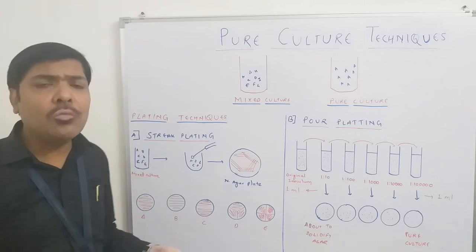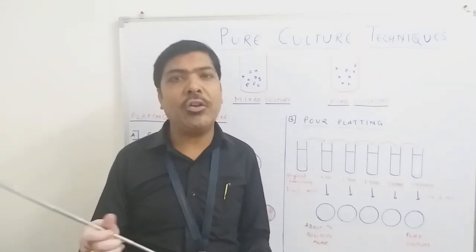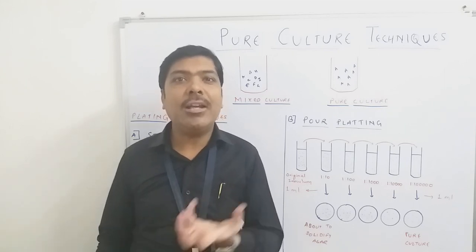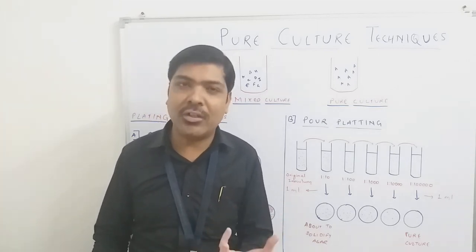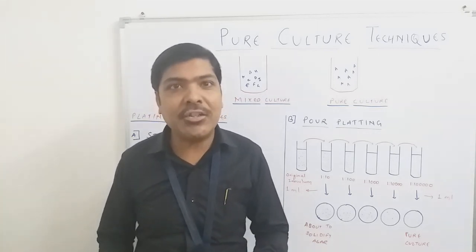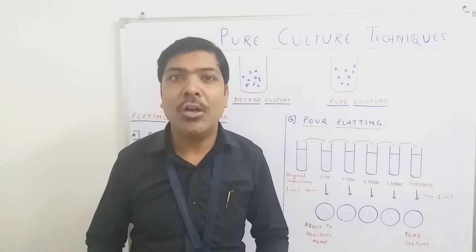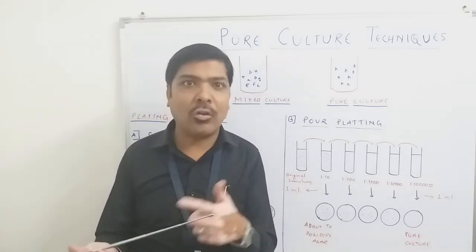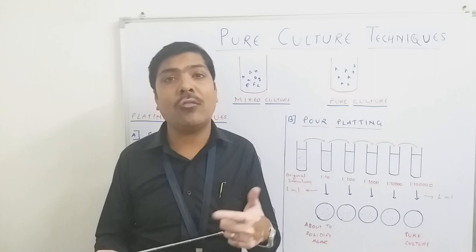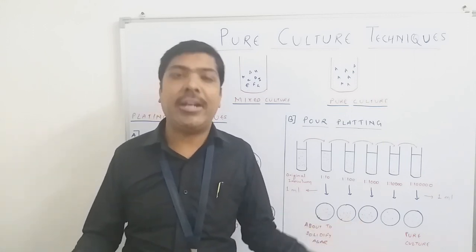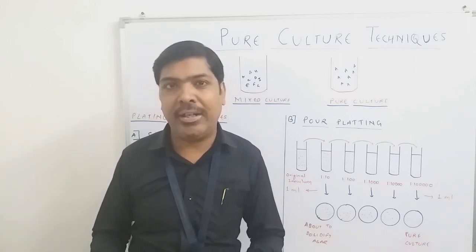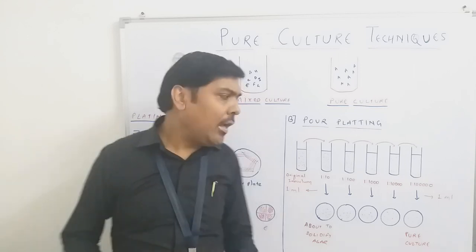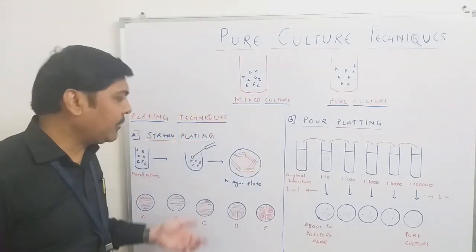We take this sterilized inoculation loop and dip it into the mixed culture. Once you dip the loop, the bacteria available in the mixed culture will stick on its surface. When you take out the loop, different populations of bacteria belonging to different categories will be stuck on the surface of the inoculation loop.